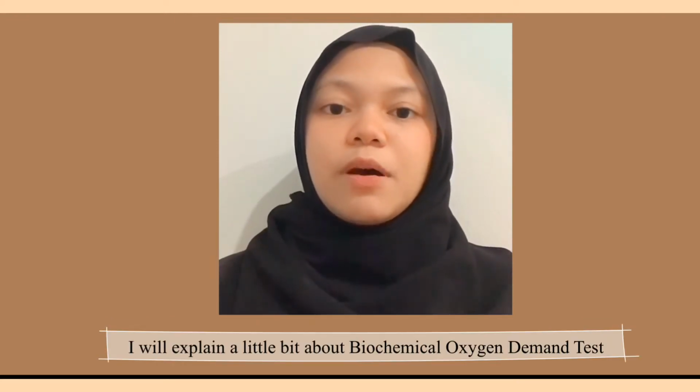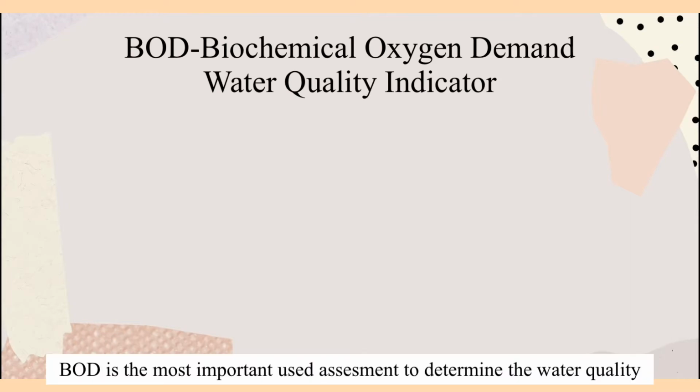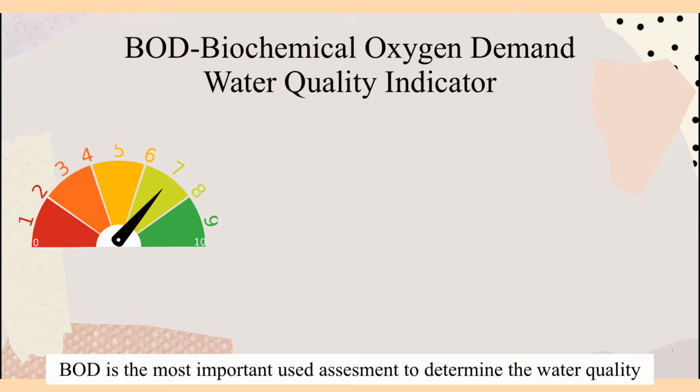Assalamualaikum and hi, my name is Ain Sofia Zoika binti Ar-Rahman and I will be explaining a little bit about the biochemical oxygen demand test. BOD is the most important assessment used to determine water quality.